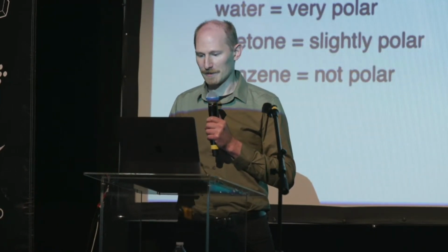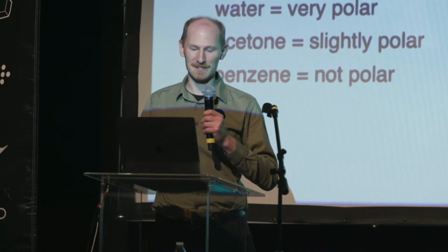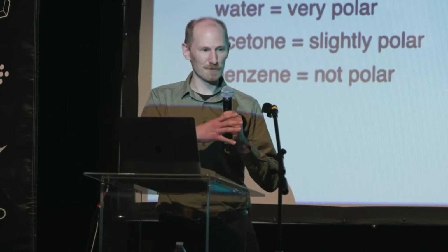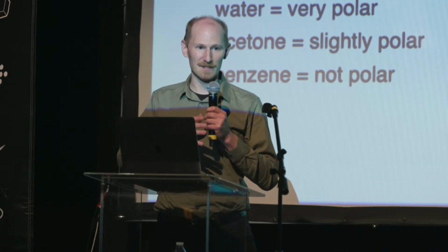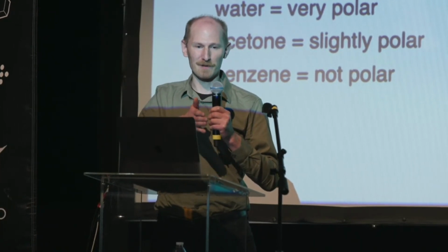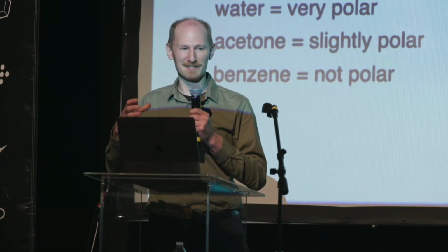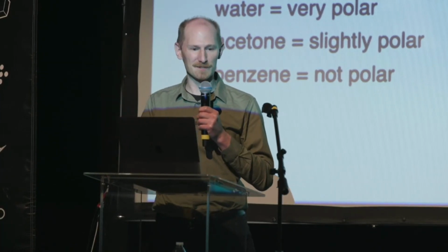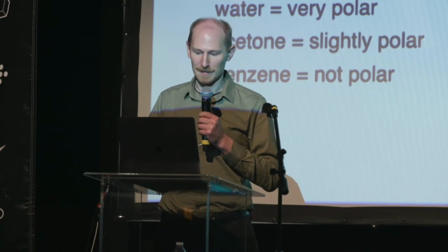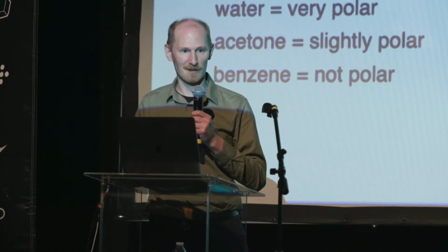And I'll talk first about what GC is. When I say it's a GCMS, it's actually two separate machines that are connected together. The sample goes through the GC, the gas chromatograph, and gets separated. And then those separated compounds go into the mass spectrometer, which functions kind of like a detector. A lot of the separation work is done by the gas chromatograph, and it's really the mass spectrometer that is doing the detecting of the stuff that's coming out of it.